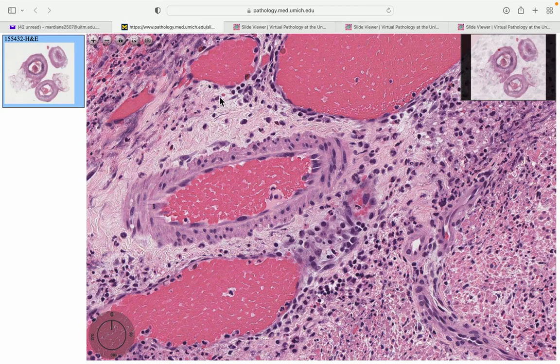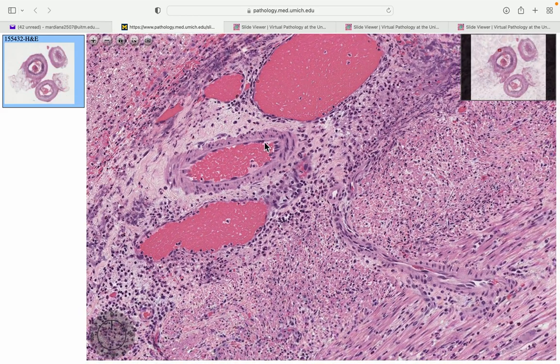These whitish, pale areas are all filled with fluid. What it does is push the cells and the structures far away. You can see the cells are now pushed apart, as opposed to areas where they are clumped together. In this region you can see dilated blood vessels and edema. See if you can find the same changes elsewhere in this slide.